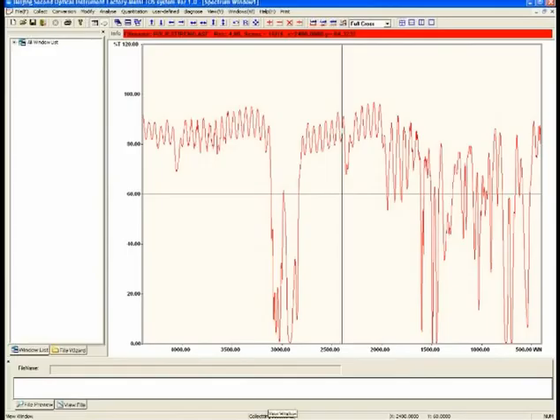After getting the pellet with the press, we introduce it into a spectrometer, and we verify that the light beam passes through the pellet, and close the spectrometer. Then the software analyzes the sample and returns a graphic with different spots representing compounds found in our sample.